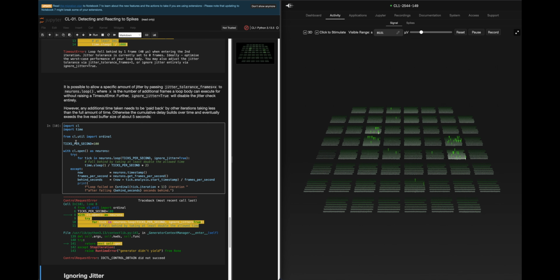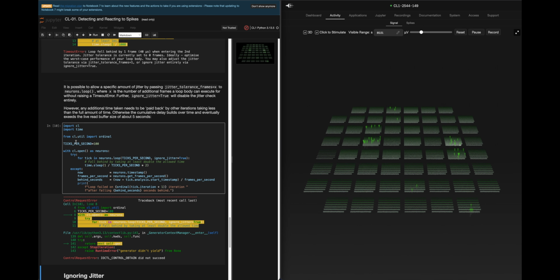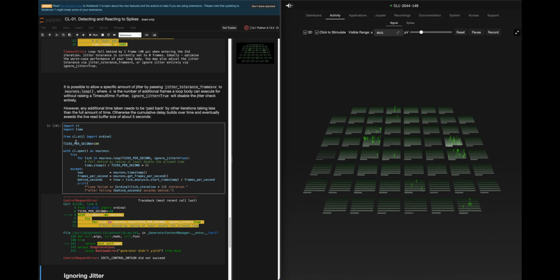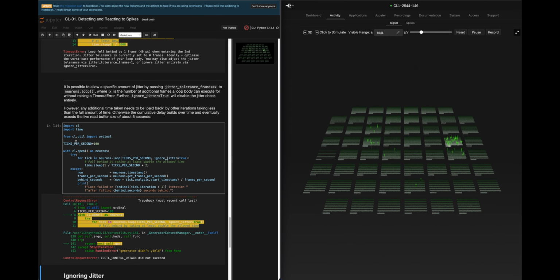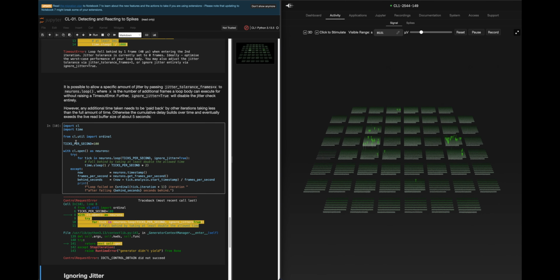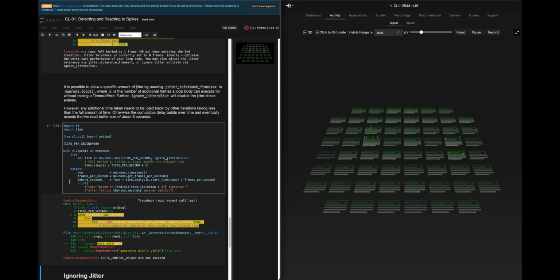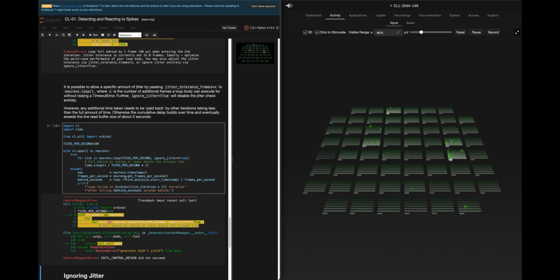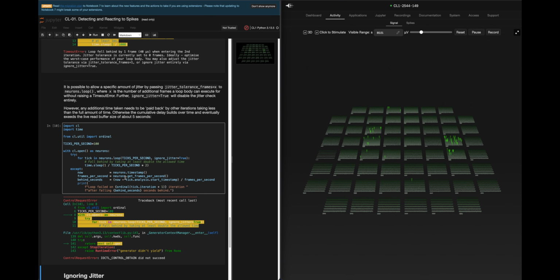What that ends up doing is it fails, and the except block runs. Now neurons timestamp gets the device's current time, and neurons get frames per second gets the device's sampling rate. Behind seconds accrues the time debt, calculating how far behind we've fallen: it subtracts the tick's start timestamp from now, and then converts from frames into seconds by dividing by the frame rate.